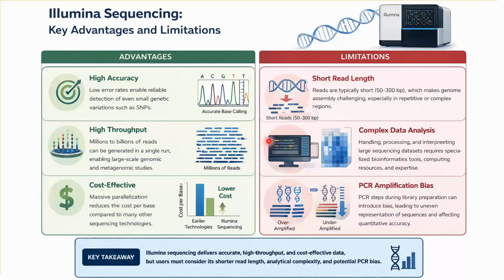However, like any technology, it also has some limitations. One limitation is the relatively short read length, which can make genome assembly challenging. It also requires complex data analysis and bioinformatics expertise, and in some cases, PCR amplification can introduce bias.